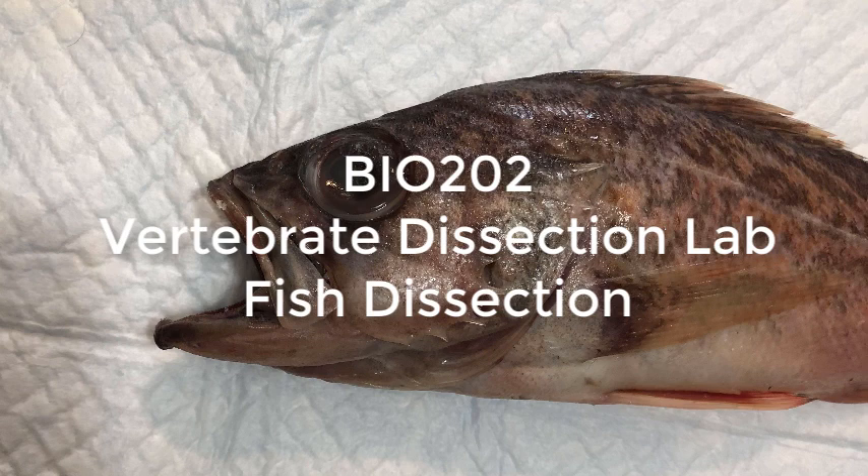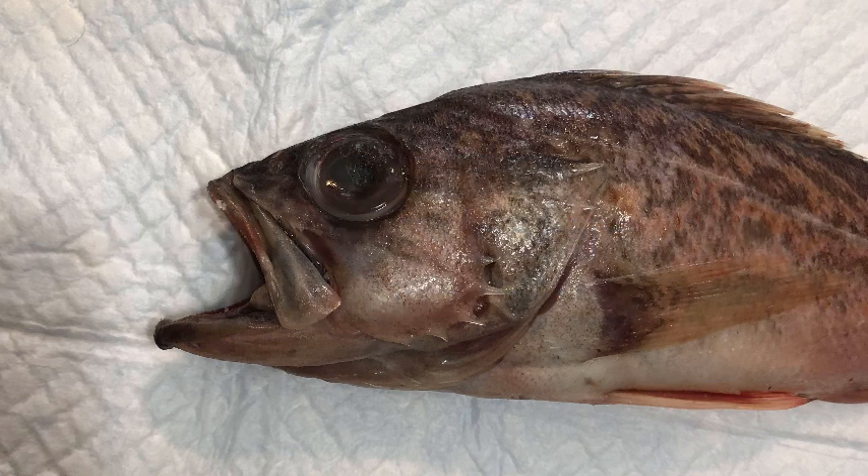In the previous video we keyed out three fish species using the Miller and Lee Guide to Coastal Marine Fishes of California. In this video I'll piece together a virtual dissection using material that I have on hand as well as some images posted by students from previous semesters. I'll focus largely on the vermilion rockfish because of the actual fishes I have on hand, it's in the best shape. Many thanks to my MiraCosta colleague Janine Sepulveda for providing me with the fishes used in the video footage.